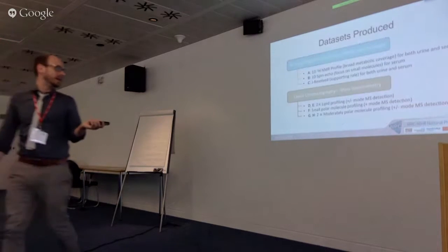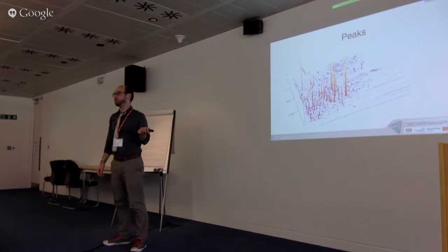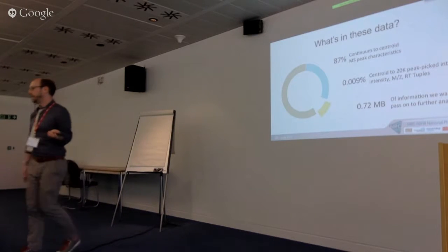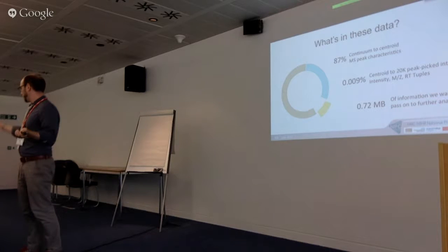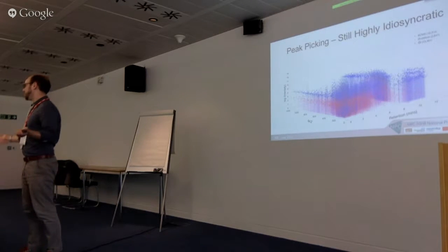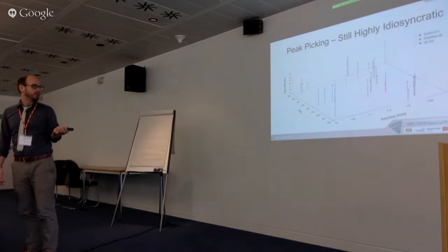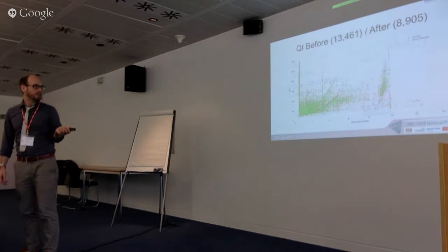Certainly in this TOF data, I think there's a lot of information that we can afford to throw away and still have a perfectly good data set. And actually, I've been doing some work with Kieran and Richard. They've been doing some very interesting work on finding out what you can actually scrape out of these data files.